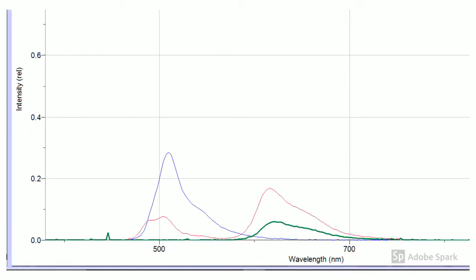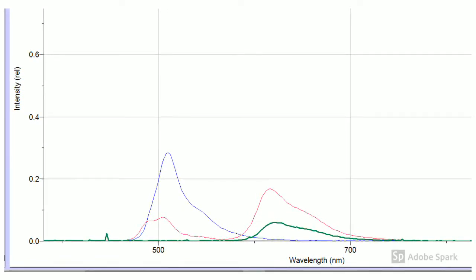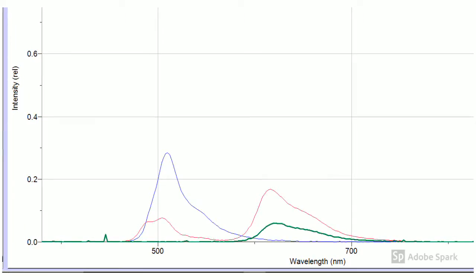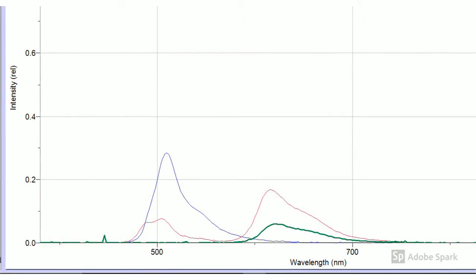Emission occurs when the electrons relax to the ground state, which releases photons of a given wavelength. The emission intensity is proportional to the number of photons being emitted. Therefore, the lambda max is when the greatest number of photons with a specific amount of energy are being emitted.